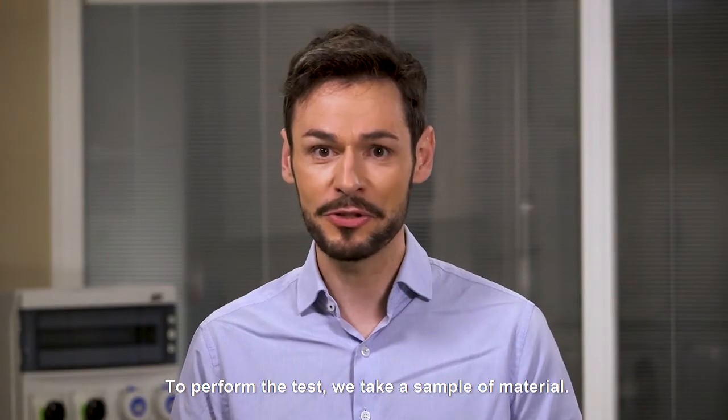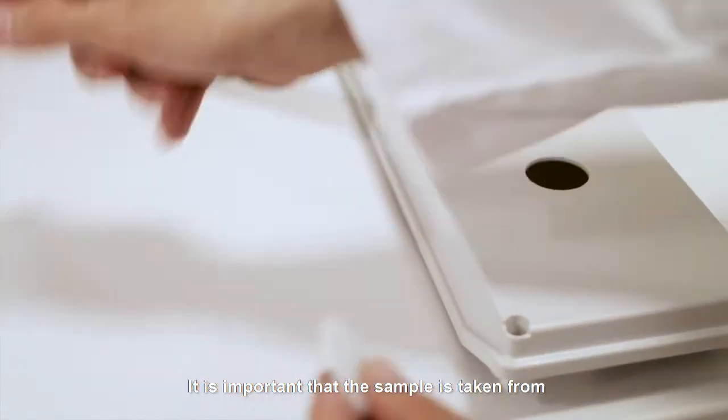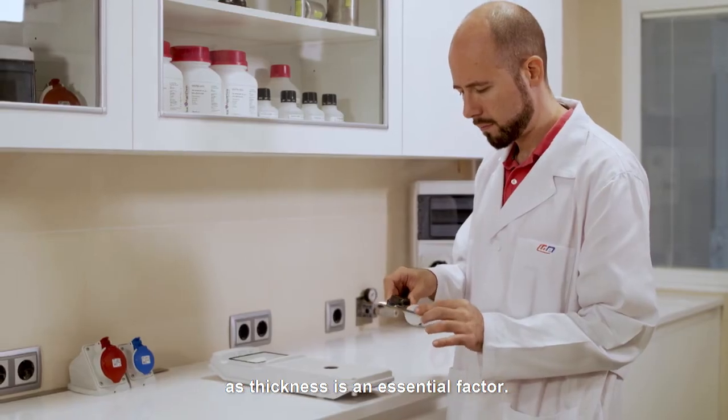To perform the test we take a sample of material. It's important that the sample is taken from the thinnest portion on the part to be tested, as thickness is an essential factor.